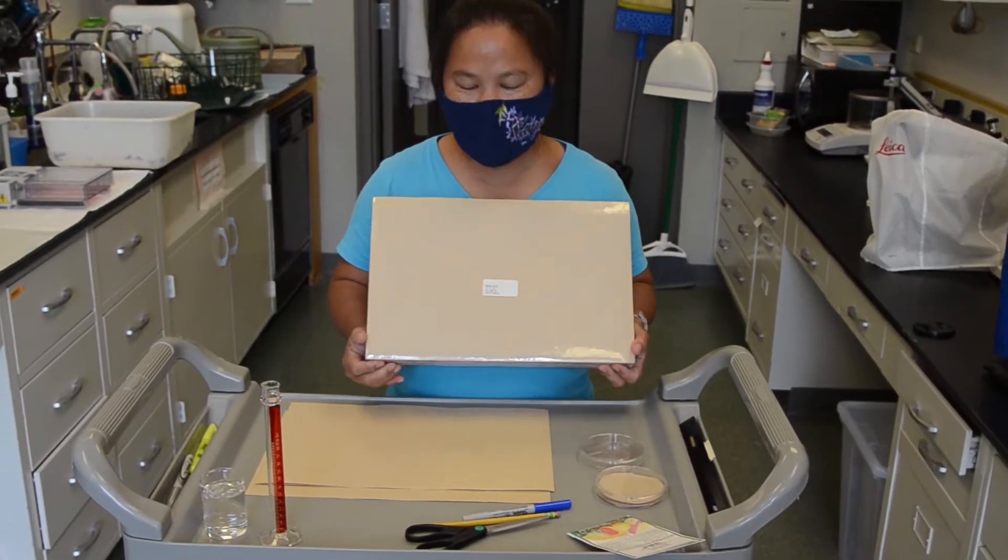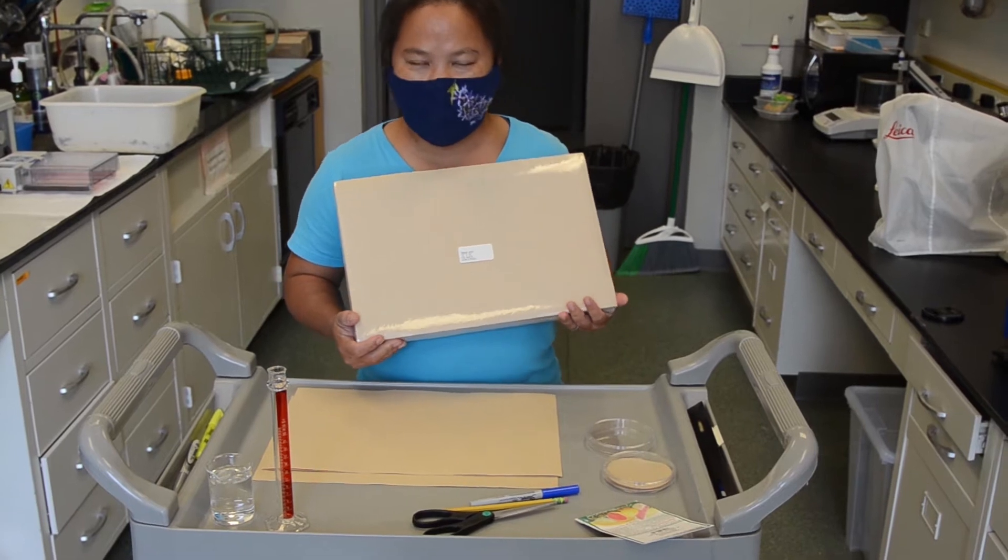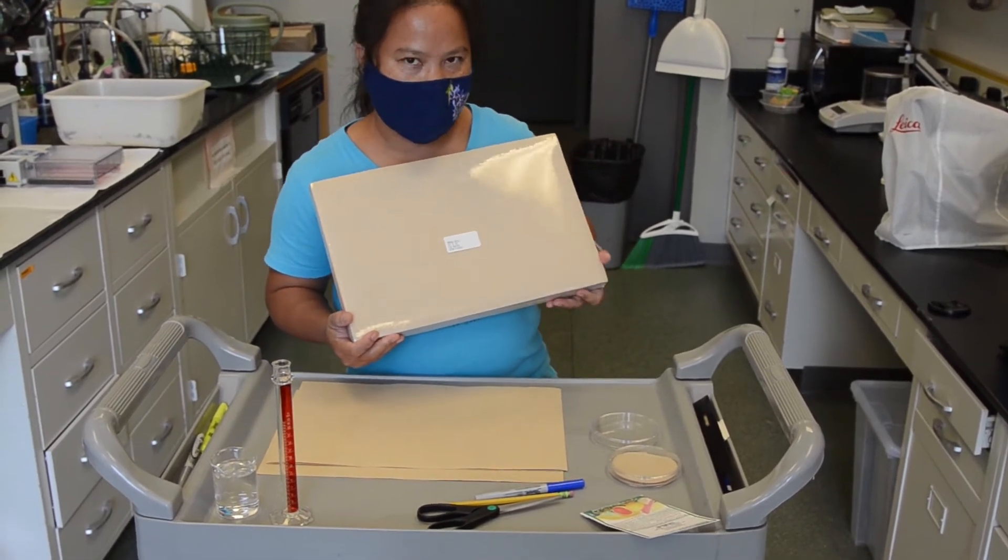Hello everyone. Today I would like to demonstrate how to do seed germination and I will show you how to use the petri dish method first.